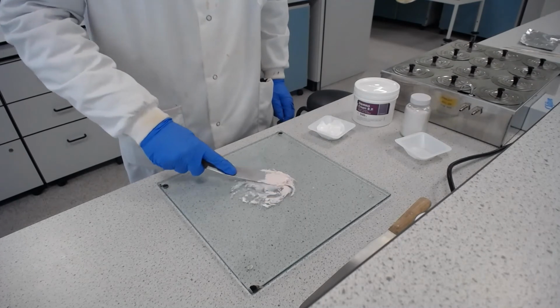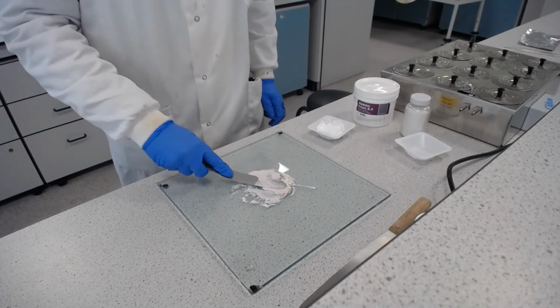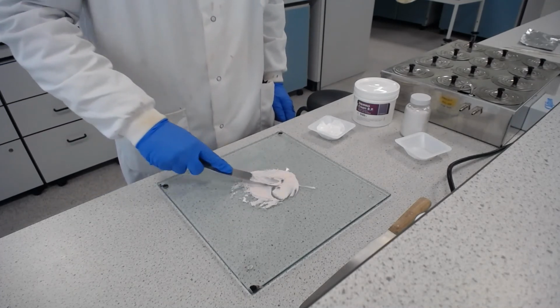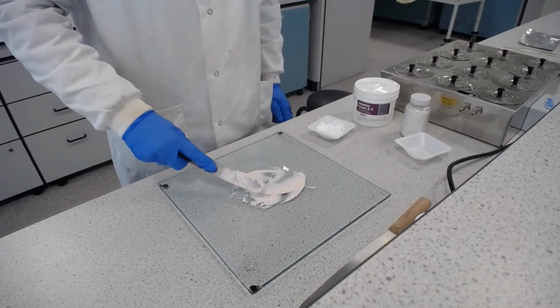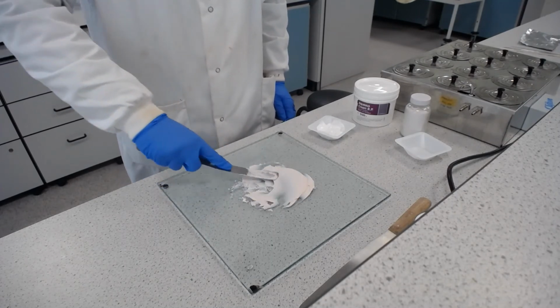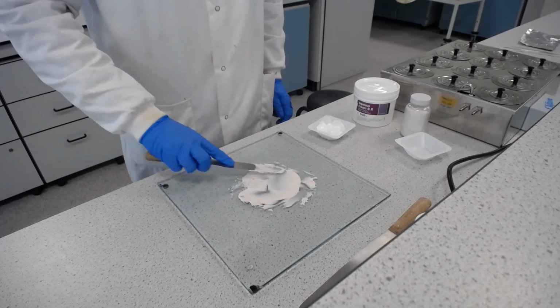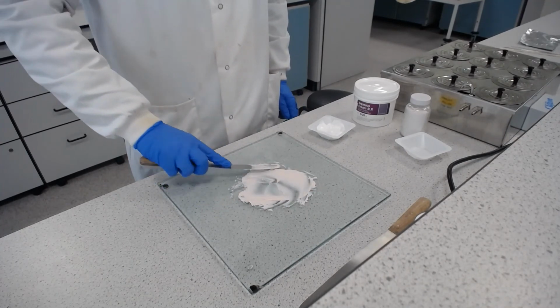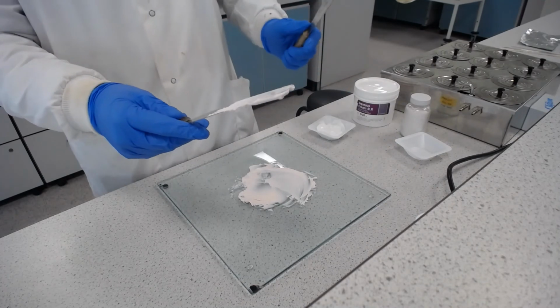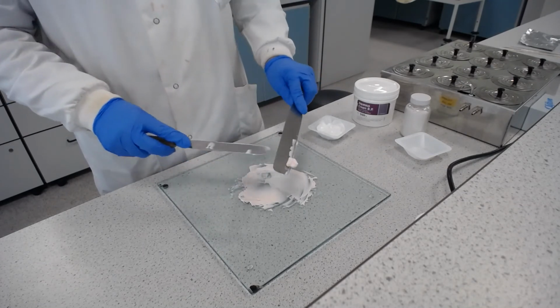So you can think of this very much like mixing together into some butter, and then once we've got all of the dry powder at least slightly incorporated into the base, we then need to start getting the grain size down with a shear force as we move the palette knife across the slab, much like spreading very hard butter onto a piece of toast. Now, you can do this with one palette knife if you're comfortable, but you'll find that you then get bits on the back of the palette knife that you need to get off. So you'll certainly want a second palette knife to clean the first palette knife as a minimum.